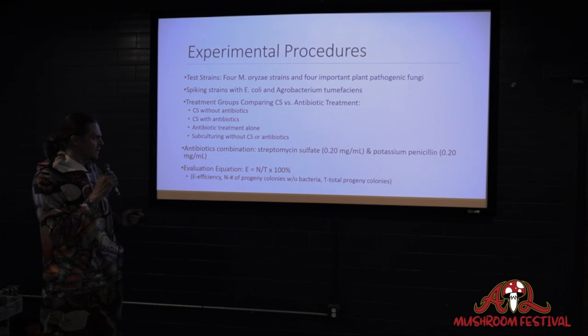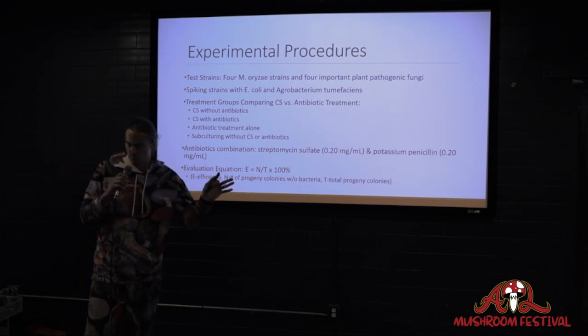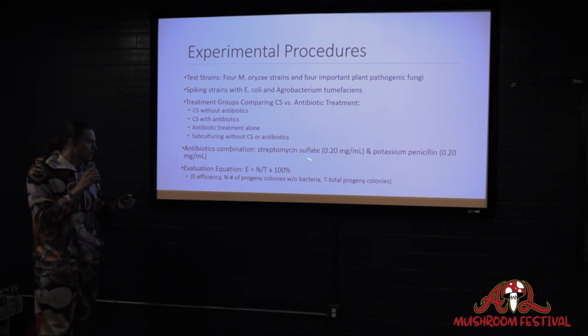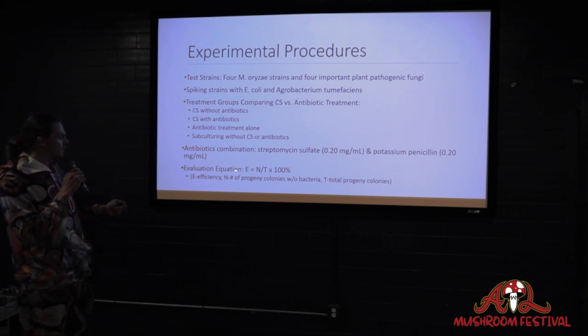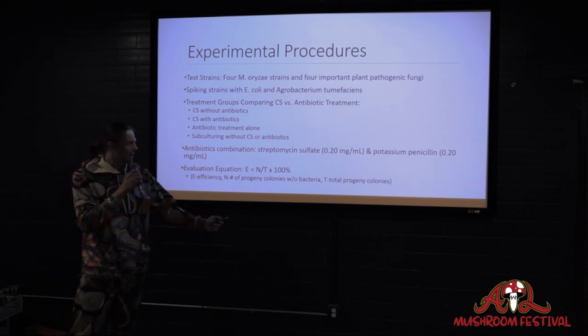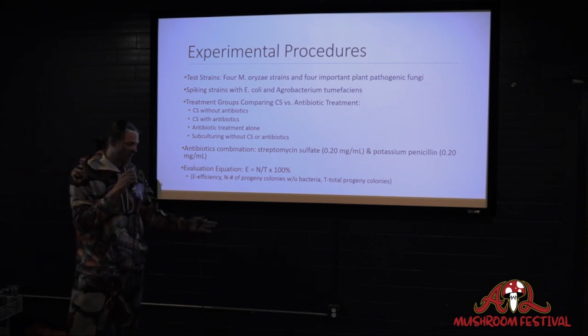And they are very common antibiotics that are used specifically in fungal culturing to remove bacterial contaminations. And they had created an evaluation equation, which was the efficiency of removal of contamination equal to the number of progeny cultures without bacteria divided by the total number of progeny cultures times 100.